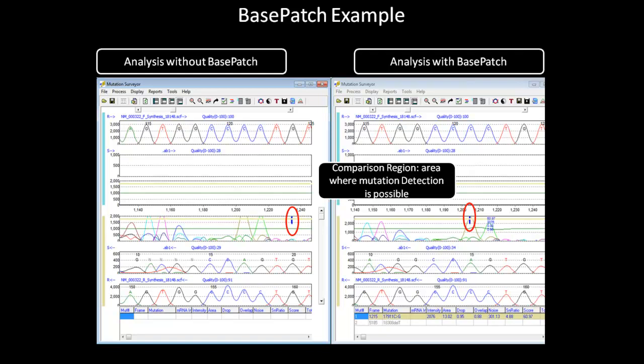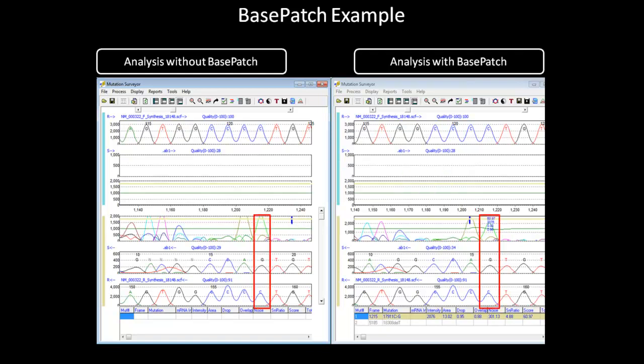The blue bar shown in the electropherogram marks the beginning and end of the comparison region, a region in which there is sufficient data to call mutations. As you can see, the mutation call made in the analysis with Base Patch, which is missed in the analysis without Base Patch because it appears before the comparison region, has a high confidence score despite the fact that it is only called in one direction.